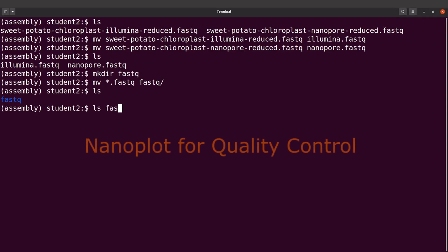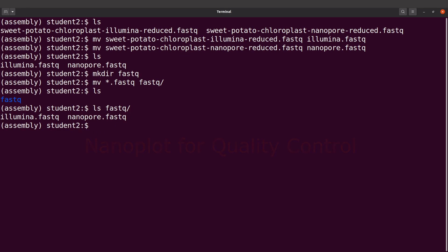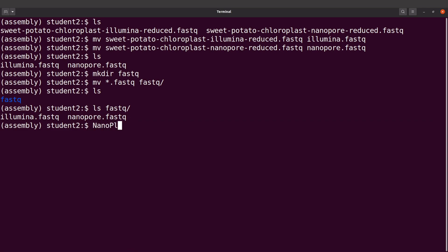In this directory I can see my files. I'm now going to perform a quality control on the Nanopore data. I'll use NanoPlot, so I'll say NanoPlots.